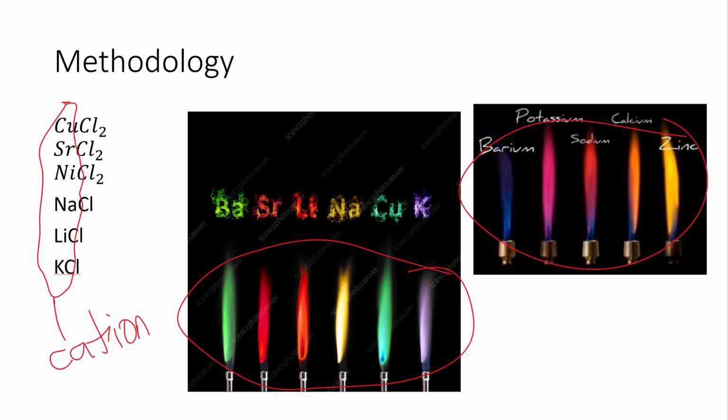We didn't do this experiment, but if you change the anion part, so the anion part is the second part here, that's kind of in purple color that I'm using, if you changed it, nothing would happen. And I know we didn't do that experiment, but it's one of the thought experiments that was in the post-lab questions for this lab. Nothing happens. That's why we didn't do it. It wouldn't have been very exciting for you to see.